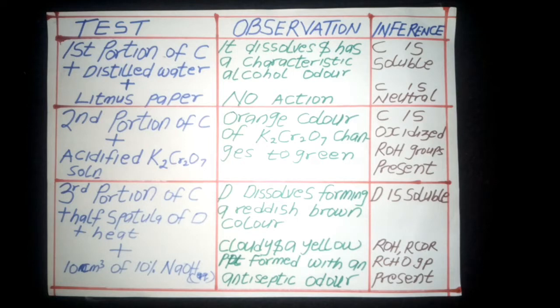So, from the specimen given, especially the sort of analysis where we are given C and D. C was propan-2-ol, while D was iodine crystals.